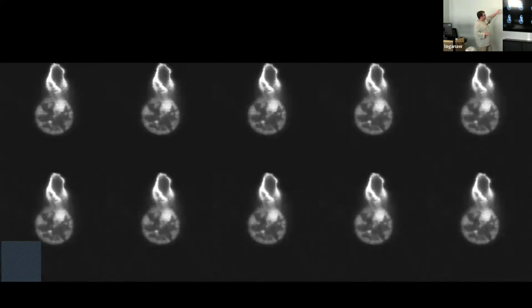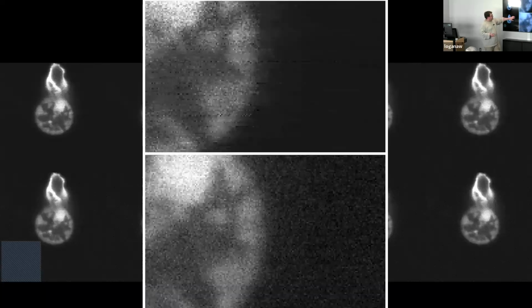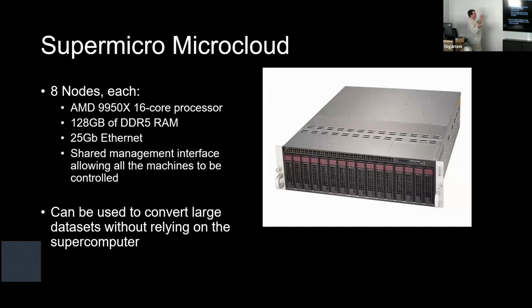This is just showing what this looks like, low to high quality, different images. This is one DRAC5 nucleus, and then zooming in. High quality, low quality blurs a lot of stuff out, but this data set is like 100 times smaller than this one. So it's kind of pick your poison as to how that's important.